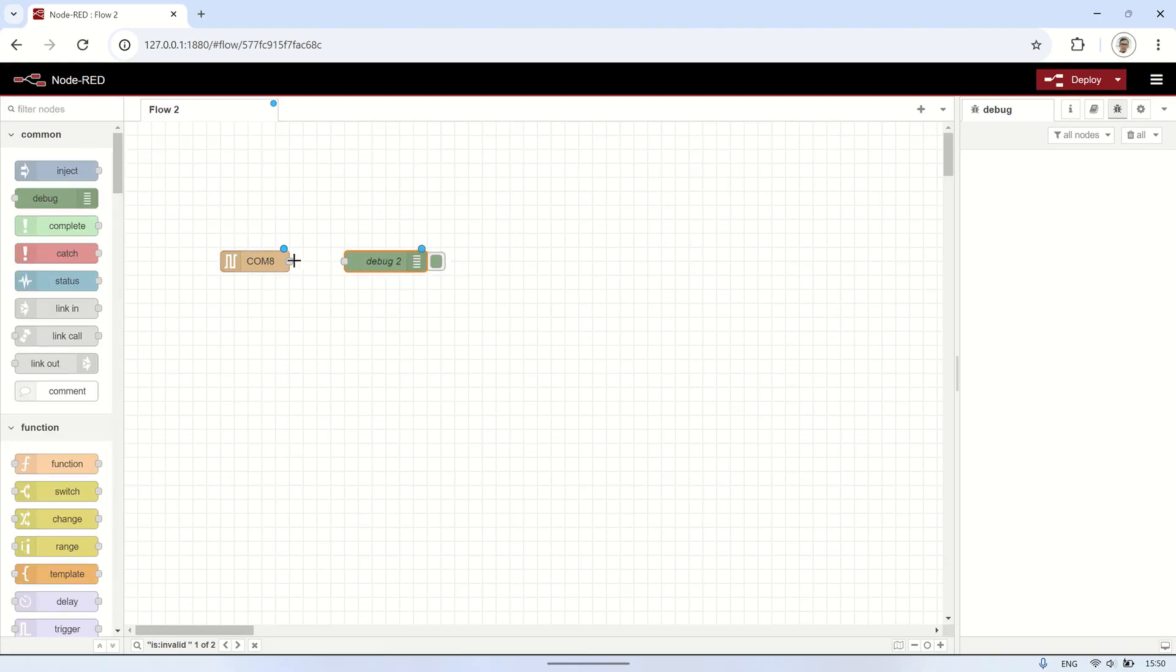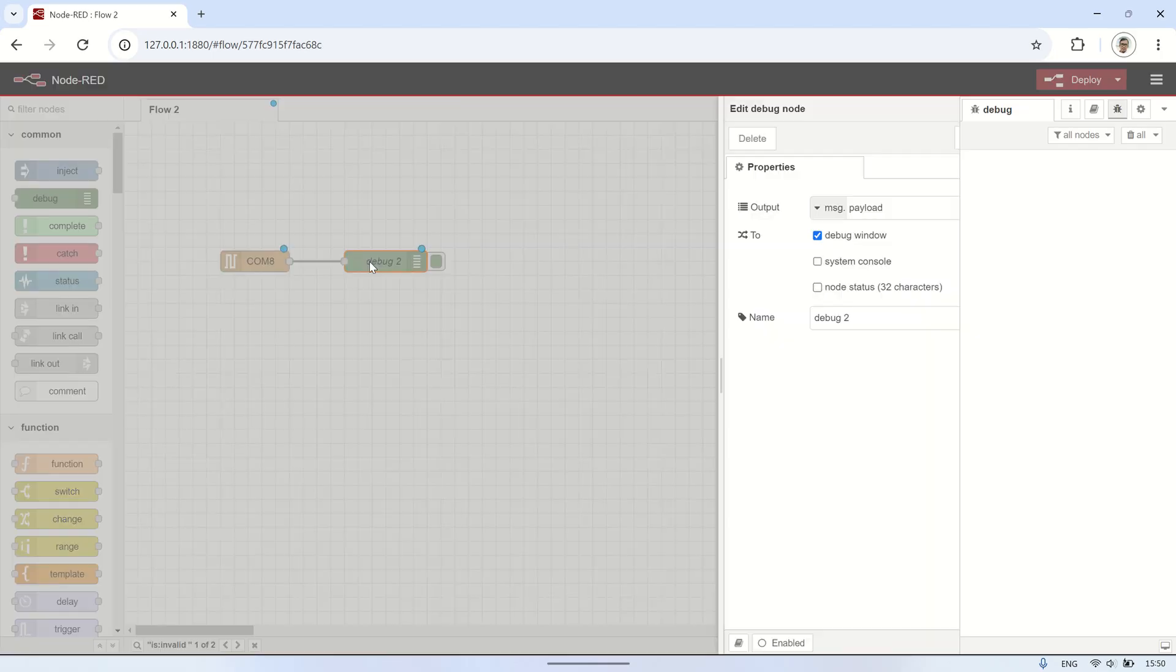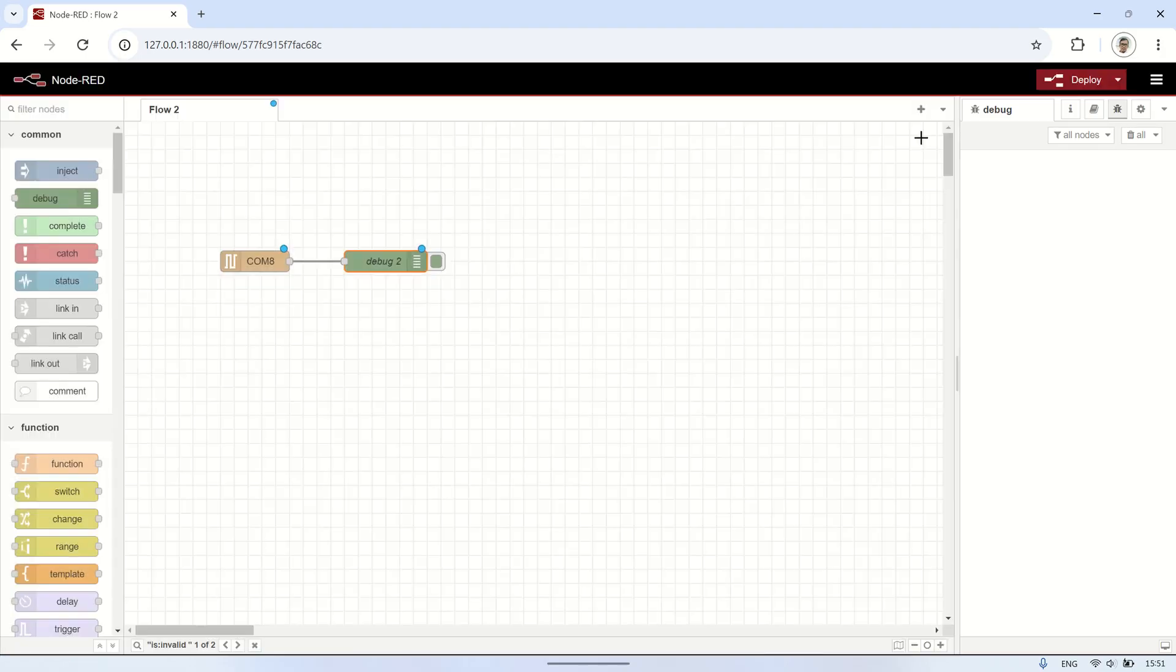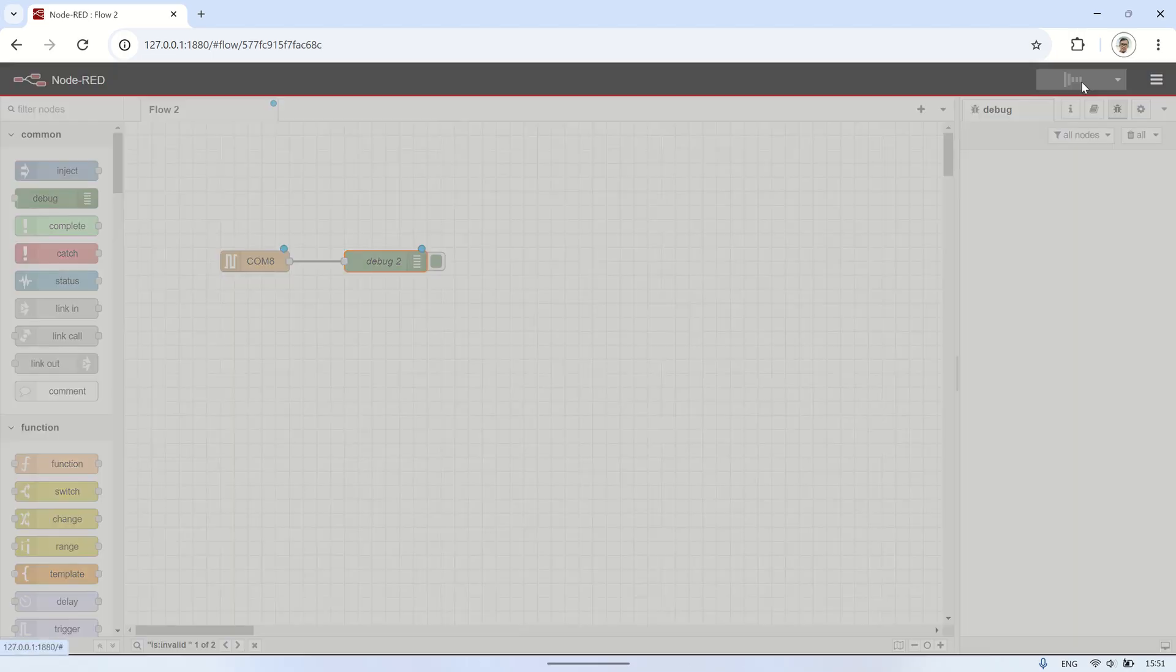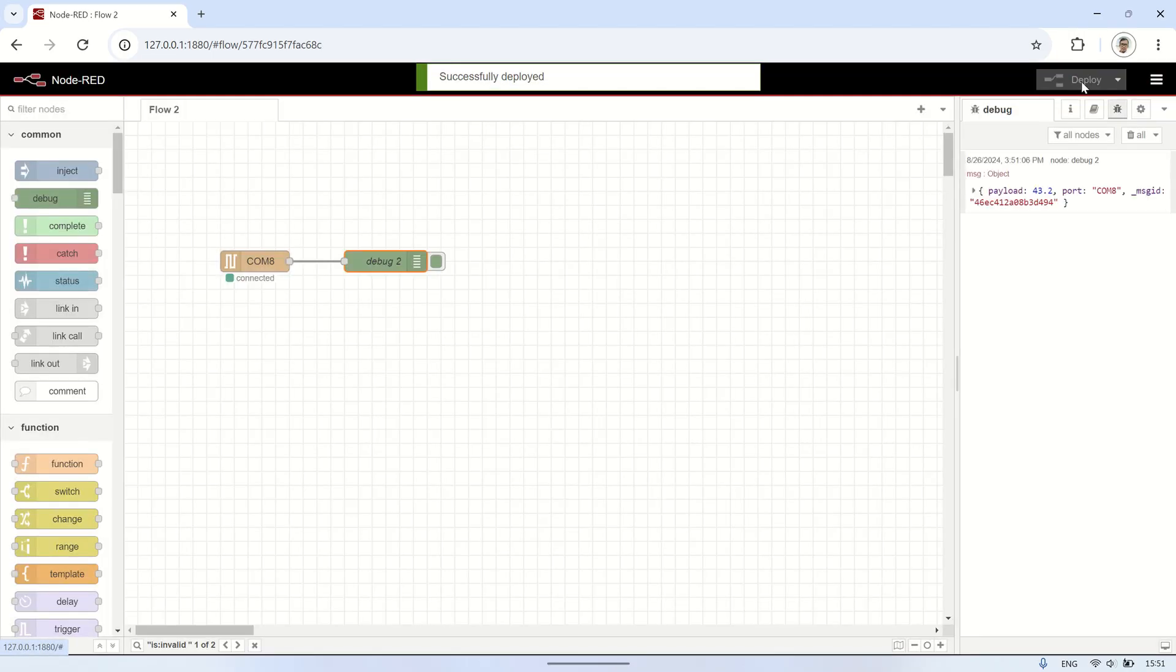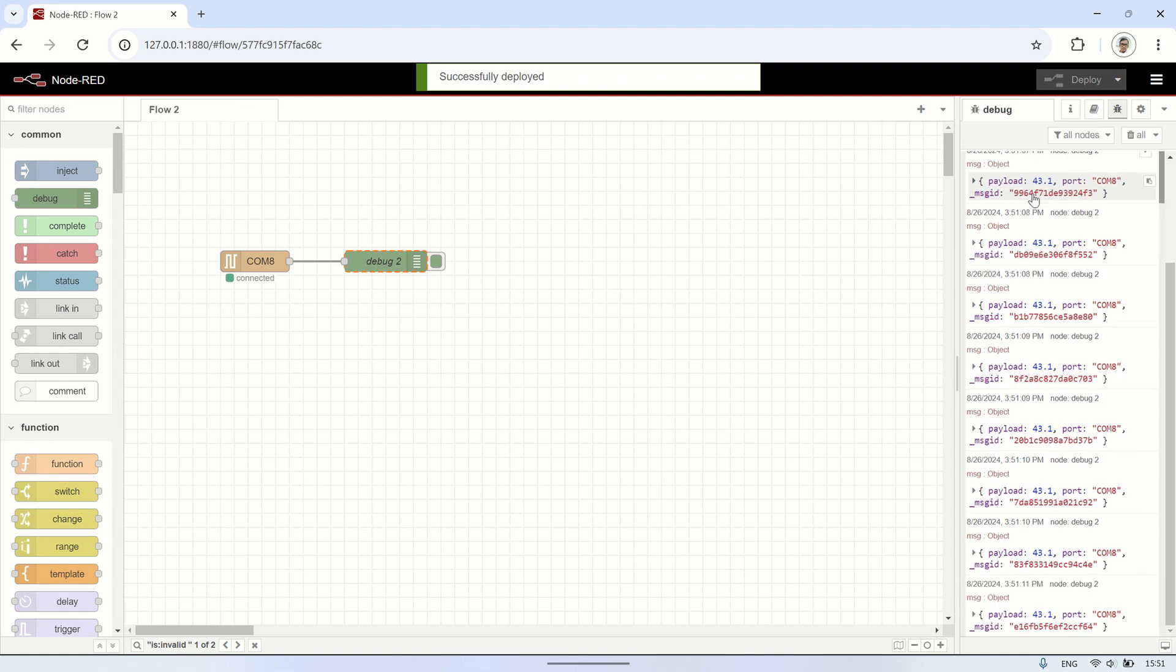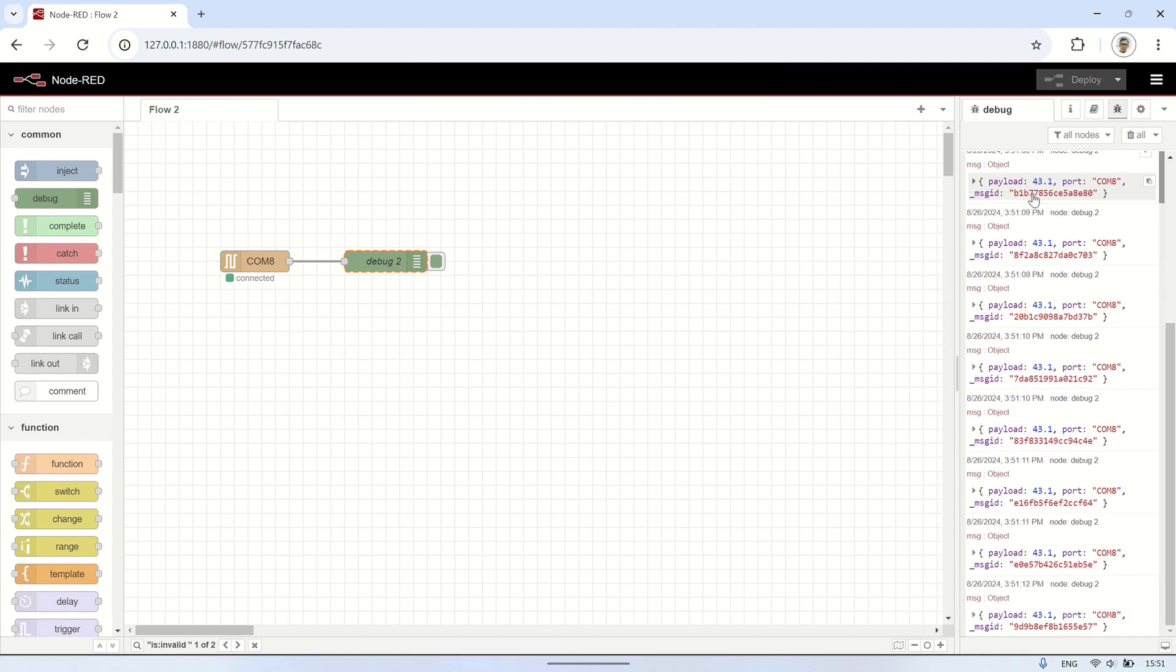Next, to view the output from the serial in node, connect it to a debug node, then deploy the flow. We can see the weight readings in the payload. These values can be displayed on the dashboard for further use.